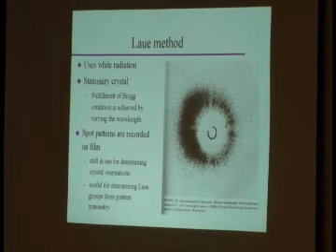Now, here's a Laue photograph, okay? This one was taken at a synchrotron, and it actually made it into a textbook. So you can already imagine that this is not what you will get if you take your own crystal and you put it on somewhere, okay? This is actually a very beautiful Laue pattern. You see data quite far out, okay? And you do see that your patterns will usually not be ideal. There's some kind of background here, okay? So it doesn't look perfectly symmetrical. But this actually, you see all of these little, you know, rounded areas where you see reflections. This is certainly a very nice Laue pattern.